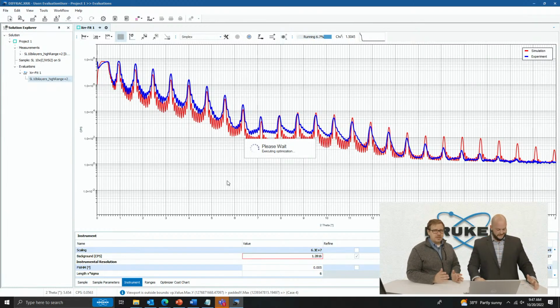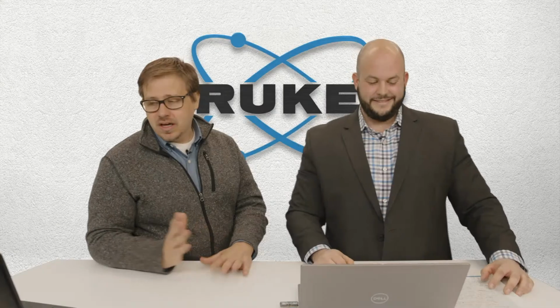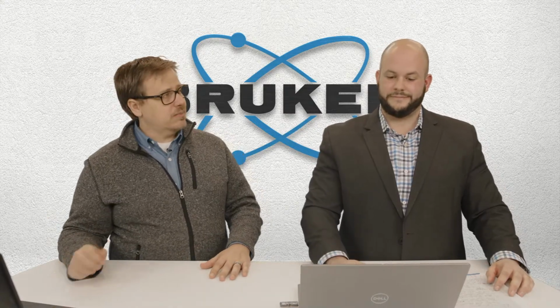So with that, though, I think let's get to some of these questions that we have. The first one I actually want to get to is one that had come in before.